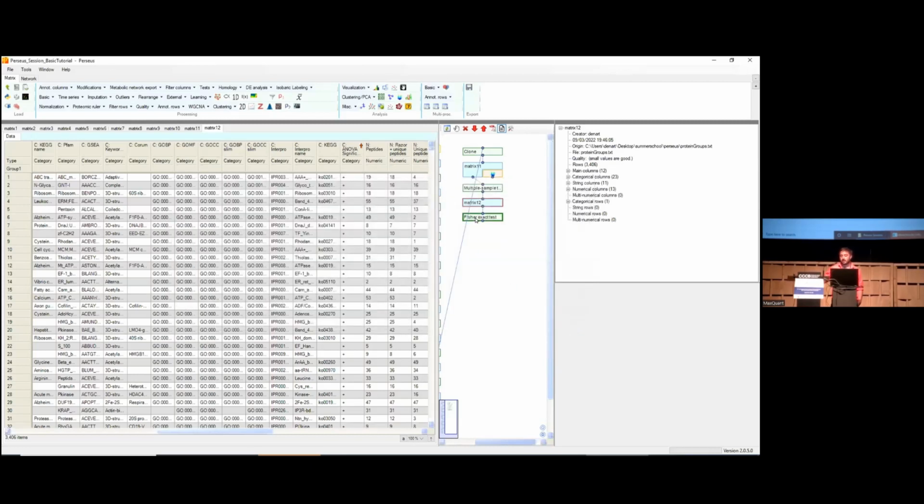Okay, so it will take a bit, and I will tell you more or less what you are doing here. So the Fisher exact test is a measure of contingency, right? And contingency is another word for association.